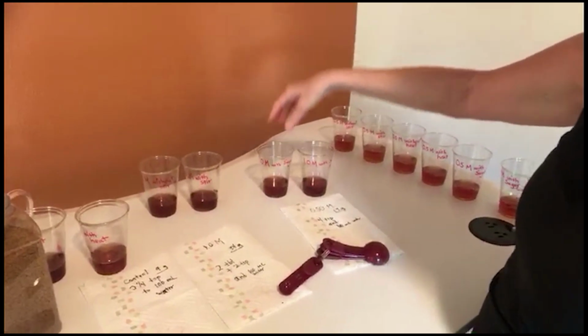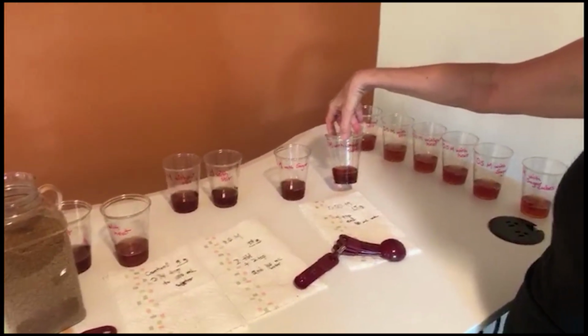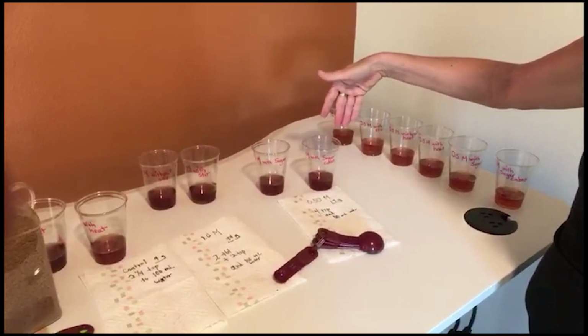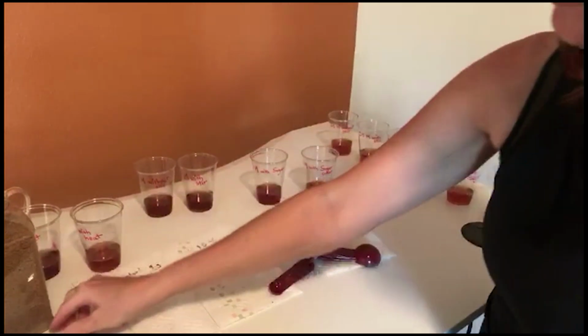All right, next is the 1.0 molar with sugar and the 1.0 molar with sugar cubes. So this would be particle size. Okay, this one was agitation, and this one would be particle size. All right, so here we go again.